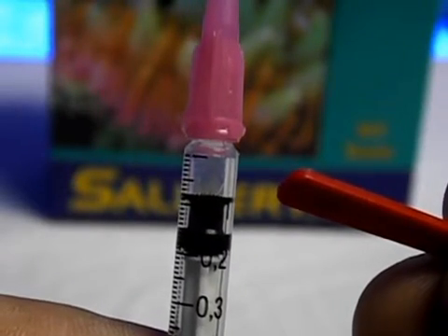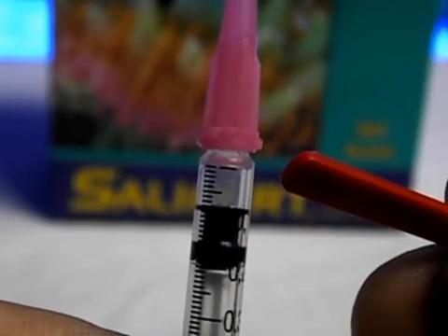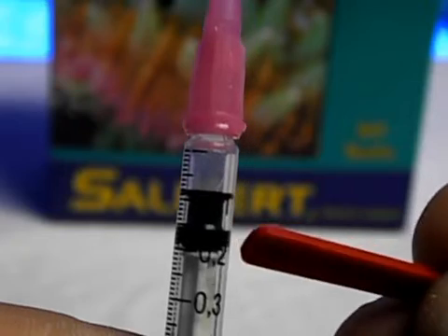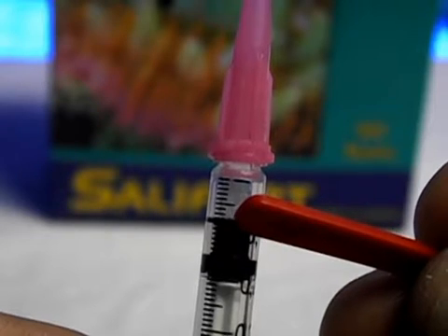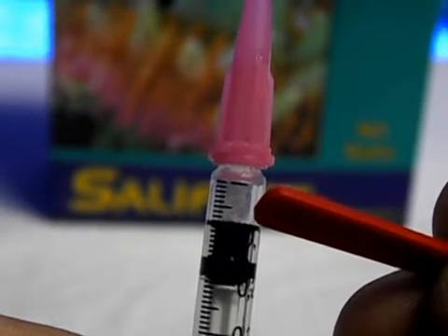Now hold the syringe with the tip facing upward and read the position of the upper end of the black syringe part. Each division corresponds to 0.01 milliliters. There's the five mark, six, seven, eight — so I'm at point zero eight.